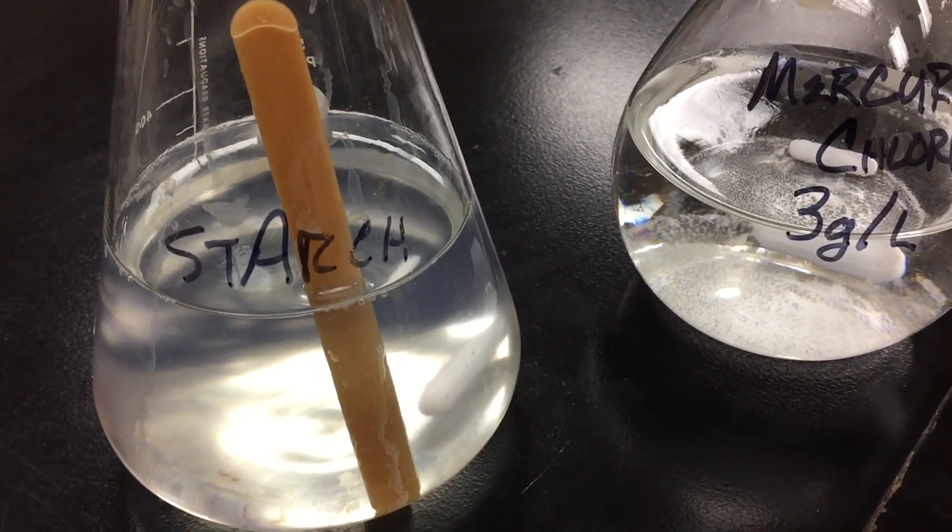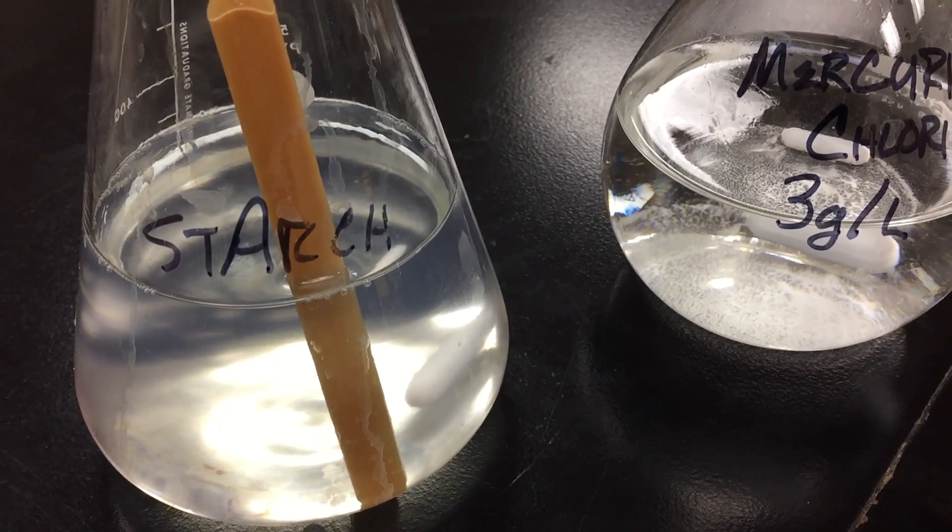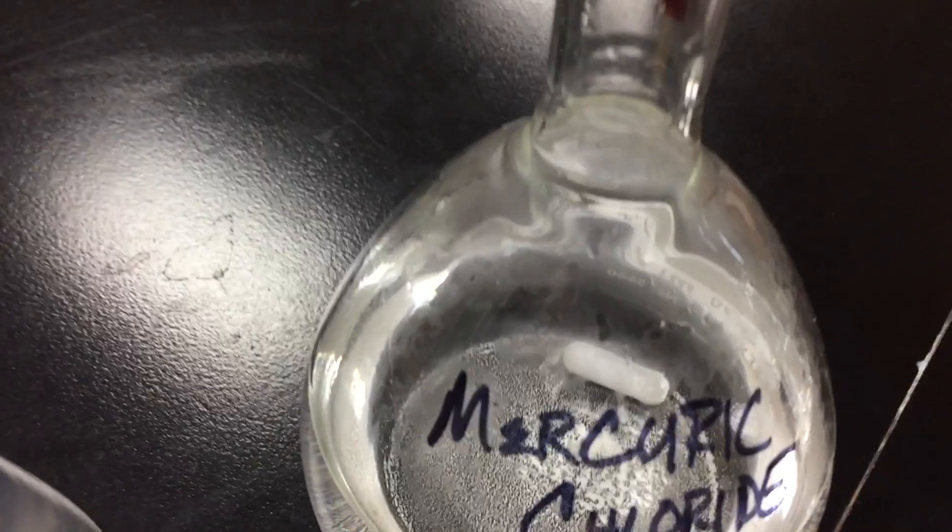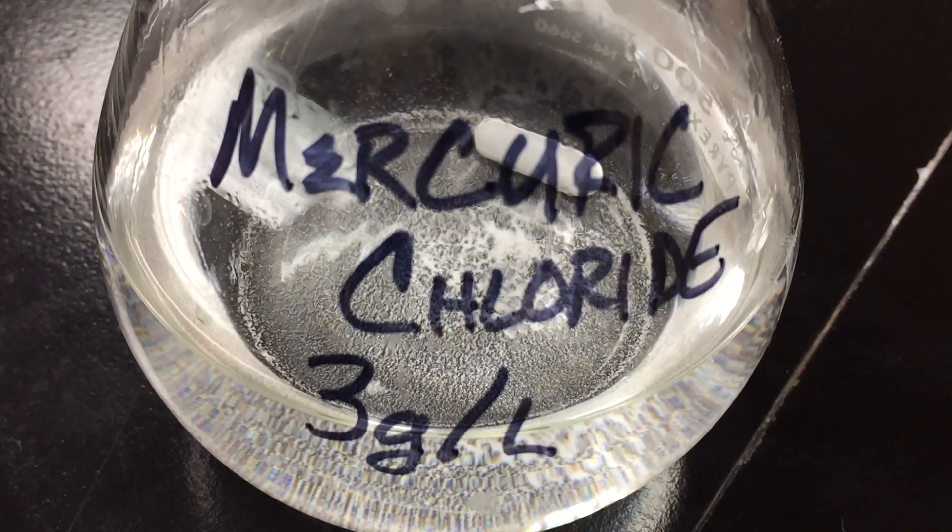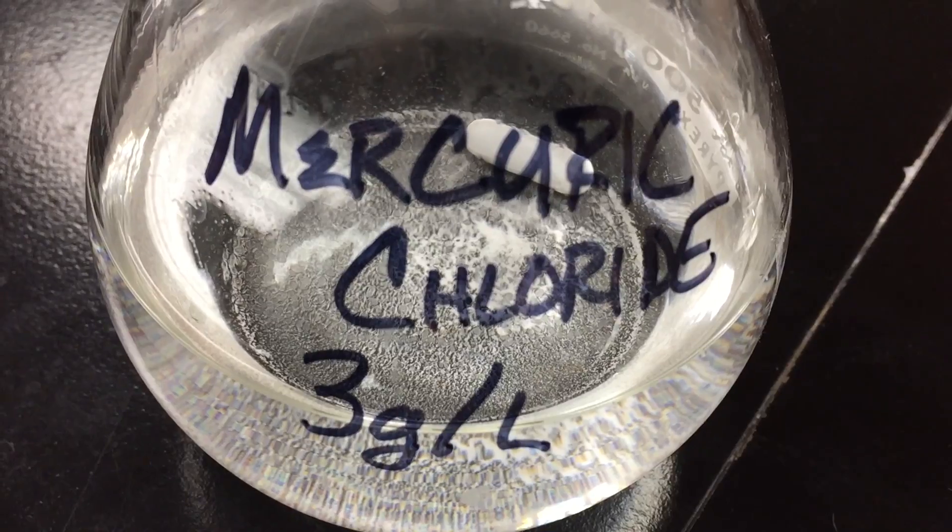We've also got some mercuric chloride, some very cool stuff. We did about three grams in a liter. I only made half a liter so it's about a gram and a half of mercuric chloride.